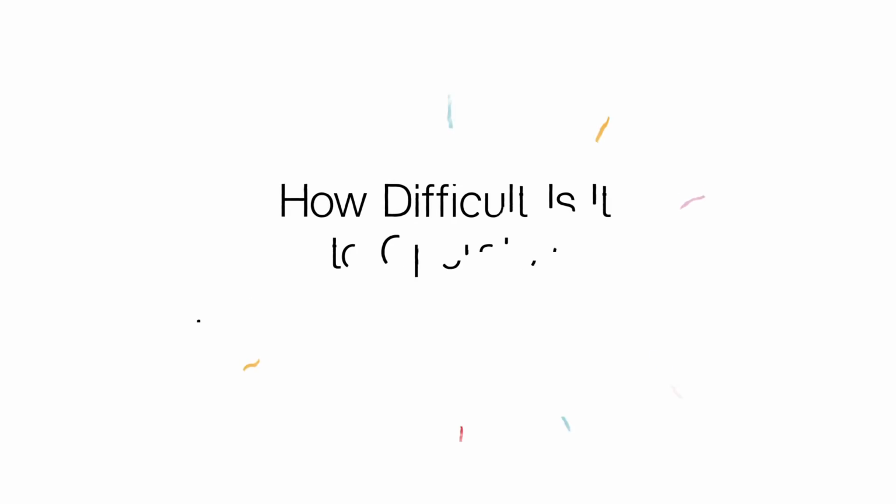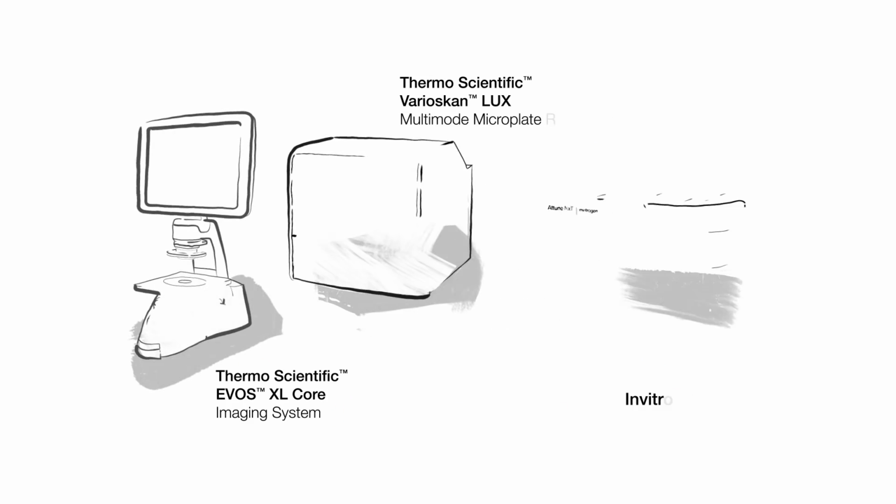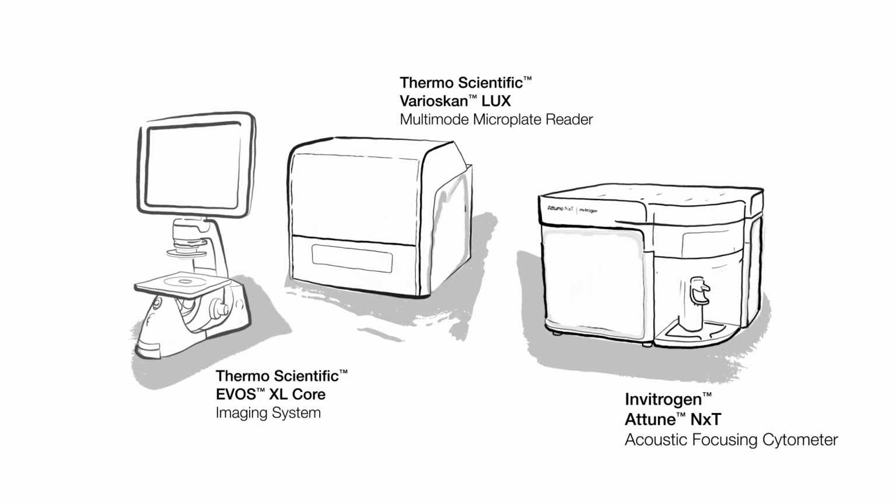How difficult is it to operate a high-content analysis instrument, and is a dedicated resource needed? High-content analysis blends 3 technologies into a single platform.